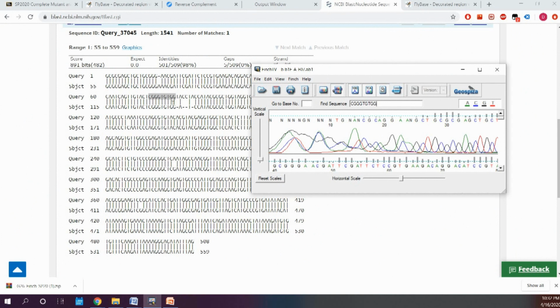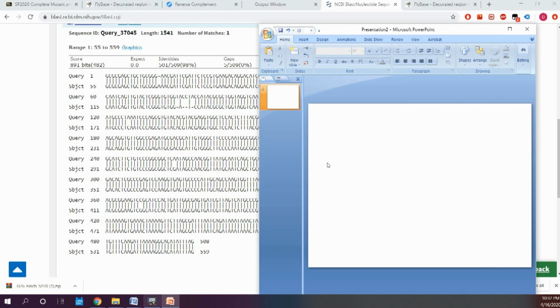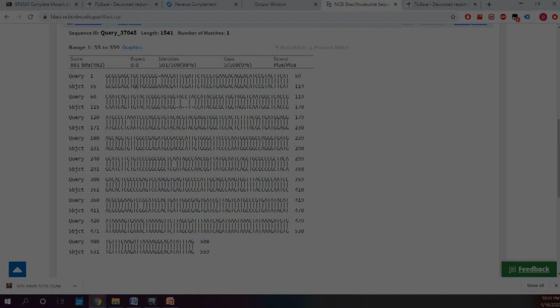shift. So to present this in your paper, what you would do is you would copy this region, and you would also copy, let's go back to here, you would also copy this region and show that you're confident in this region. And let me do that real quick for you guys. So the shortcut in Windows is Windows Shift S, and what that's going to allow me to do is screenshot an area. So let's do something like this.